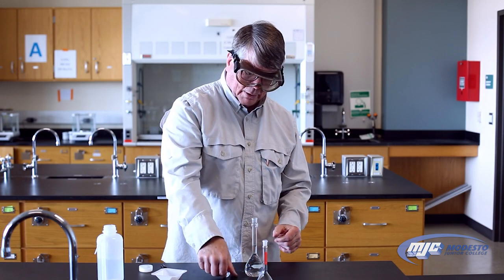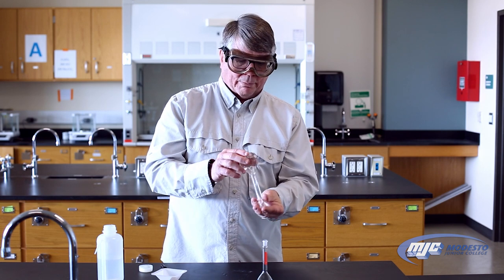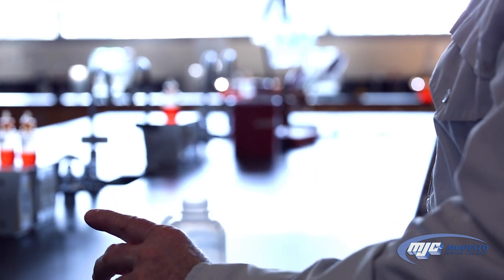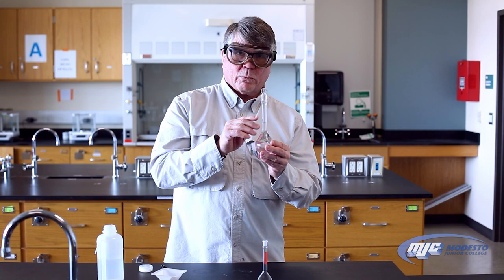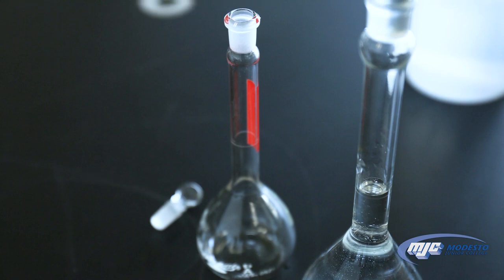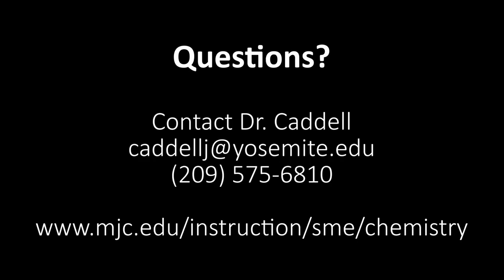I'm going to take the ground glass stopper and put it in the top. Don't push it hard — just set it in there and it will seal. I'm going to mix the solution up: turn it upside down, give it a little shake. Now I have 100.0 — this is a 100 milliliter volumetric flask, so this gives you the tenth place: 100.0 milliliters. Different volumetric flasks have different places to where you read them; your professor will tell you how to read your volumetric flask.